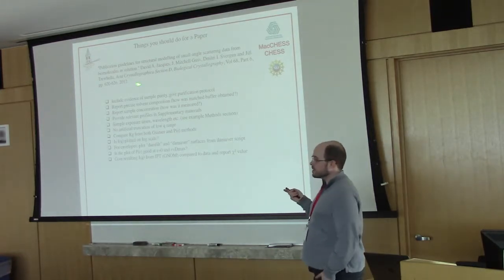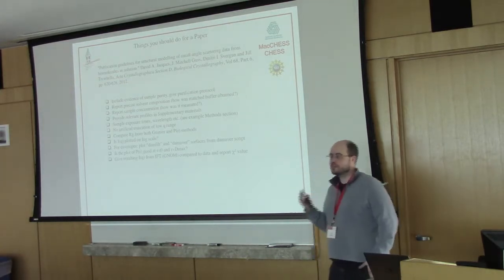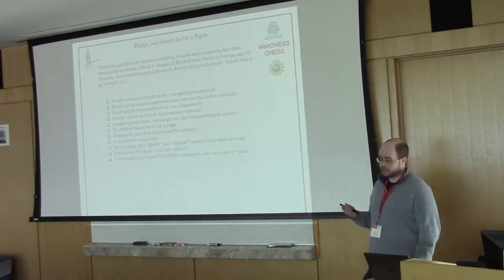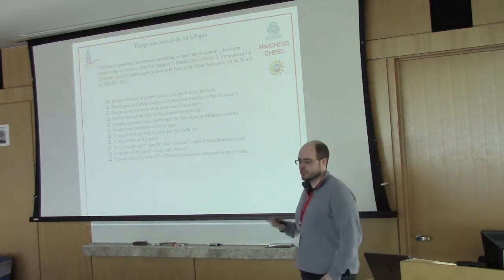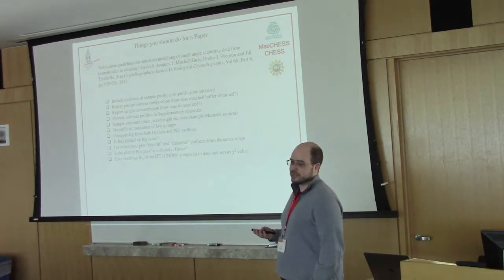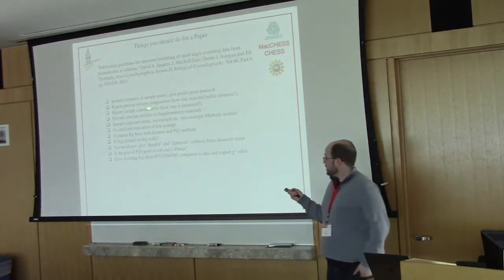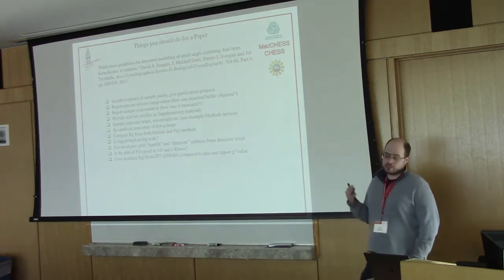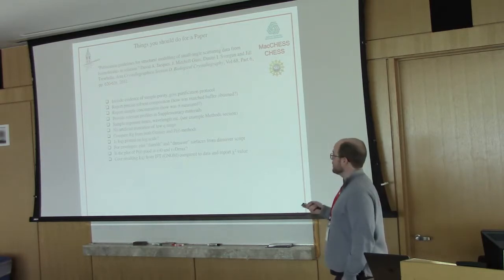So you need to really include evidence of sample purity. Kushal talks about figure 1, where you have to prove to the reviewers and to yourself and to anybody who's reading the paper that you know what is in that solution and that you know exactly what you are scattering from, and you can show that it's your organism of interest. You need to report exactly what your buffer was and how you got your matched buffer, because again, that's something that can really mess you up.